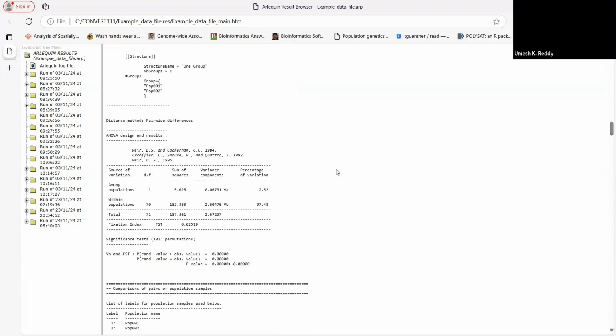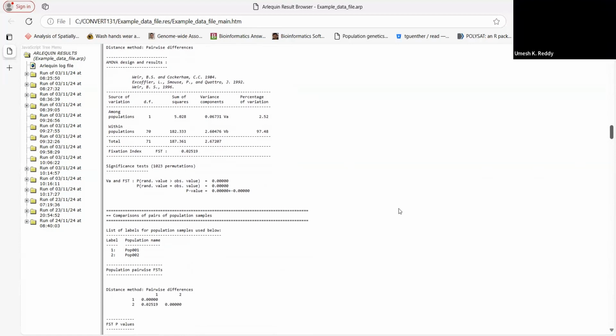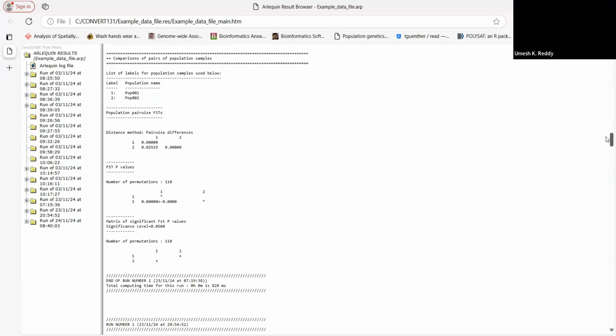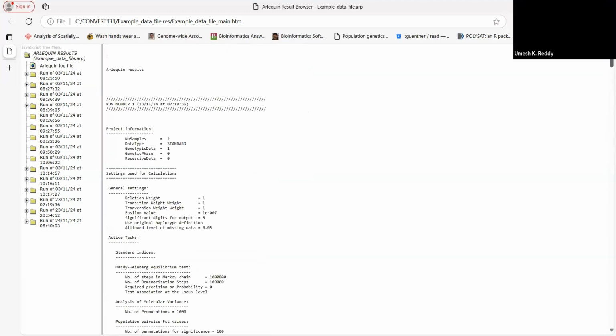Yeah, the FST will be there. FST p-values. Here is the FST. That is the population differentiation. Okay, distance. It's not FST. FST, let us see it in the PopGene format. This has not been given properly. Okay, so I will stop here, record this, and then open PopGene. Okay.